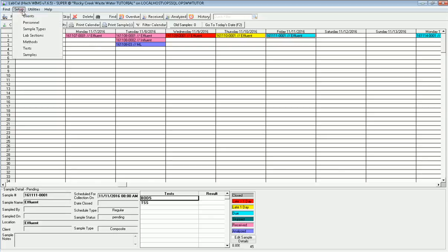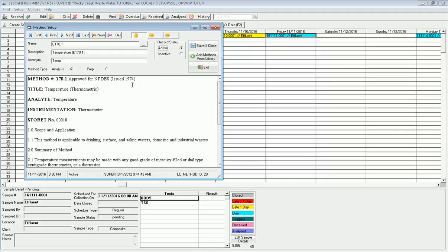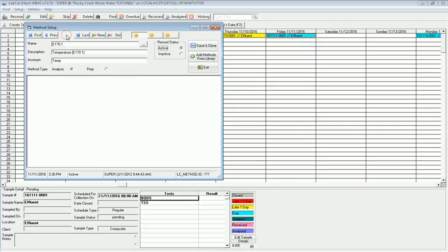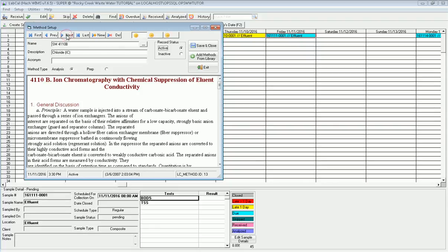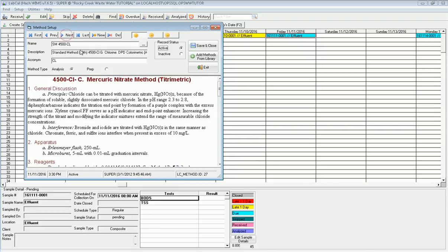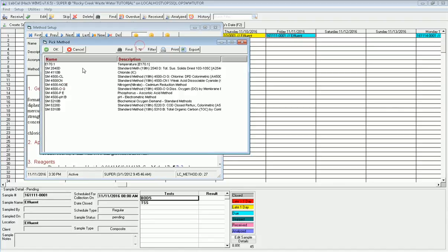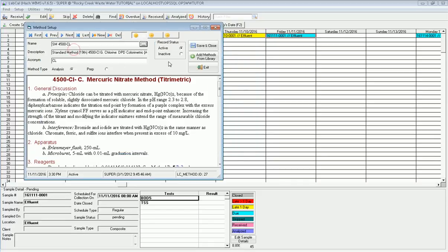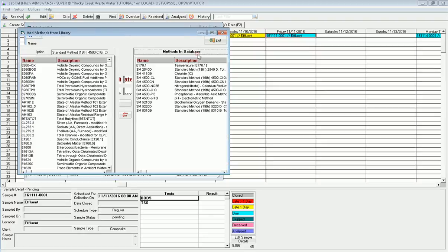I need to set it up, so I'm going to go to setup. There's several sections here that I can do, but I'm going to start with methods. Right here I get the list of the methods that I run in my lab. I can scroll through them and see what I got. If I go to browse, I'm looking for method 200.7, my metals. In here I don't see it. So I'm going to click cancel and add that method from the library. I could also just click new and type it in, but I'm going to see if it's in my library here to pick from.